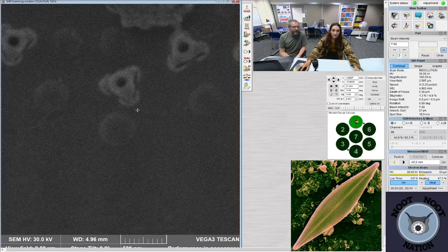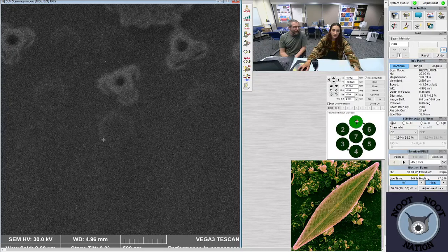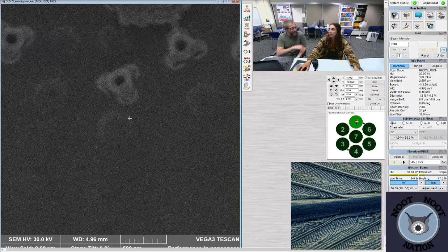And then the little thing that's below it is an areole, which you should be able to see, if you had your stigmation right, have like a salt and pepper shaker sort of head to them. Should we fix that? I think it's a good idea to try.